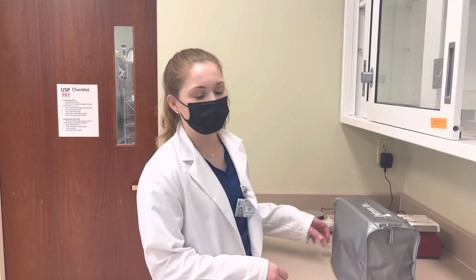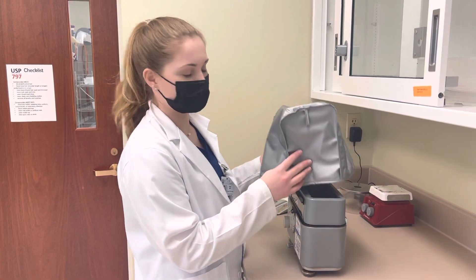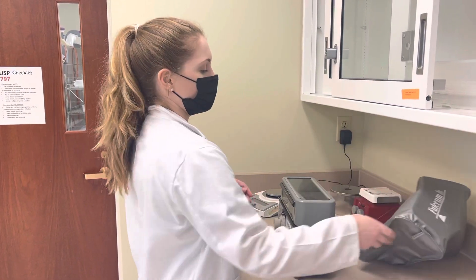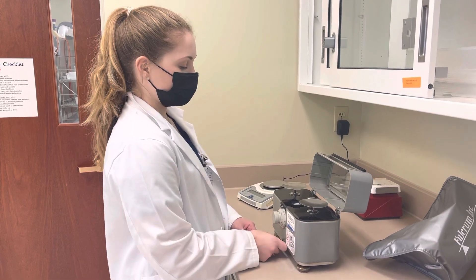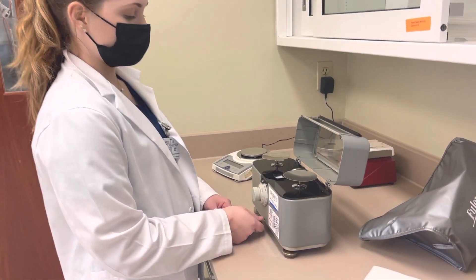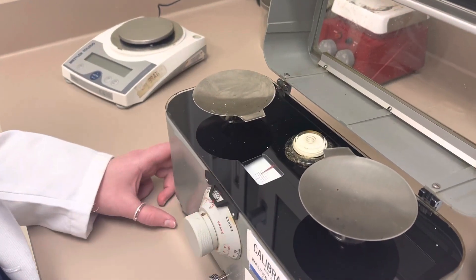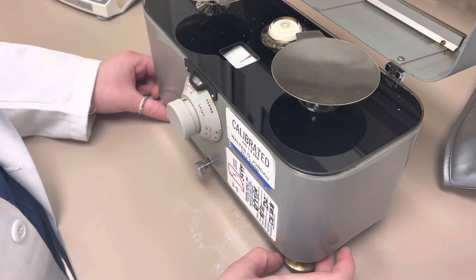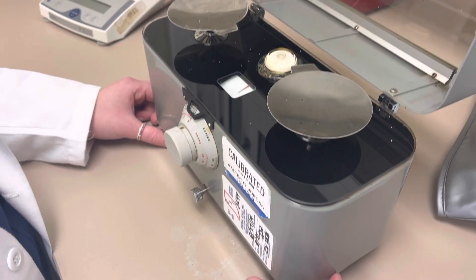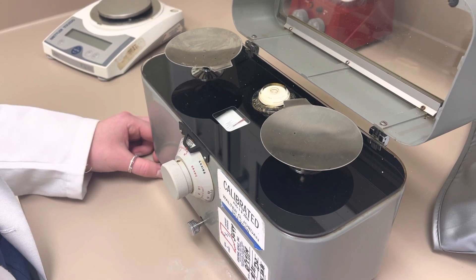Hi future self. We're going to use a torsion balance today. Take off the cover, open it up — it should be locked, so you're going to unlock it. It should be somewhere in the middle, and you want the dial to be in the middle. If it's not, use the little feet at the bottom to adjust it either way until it gets somewhere in the middle.